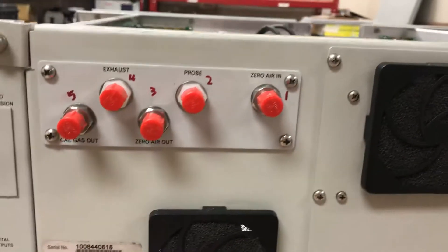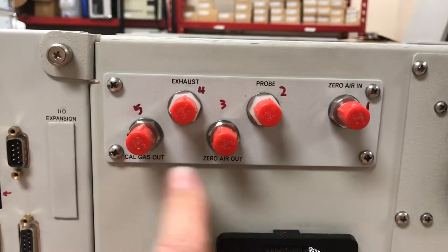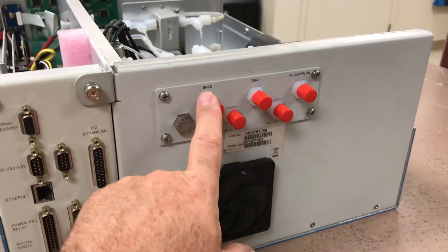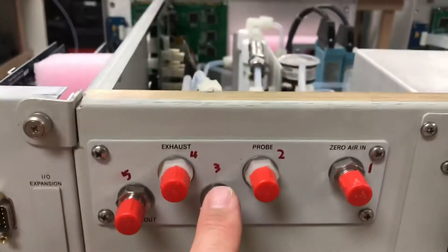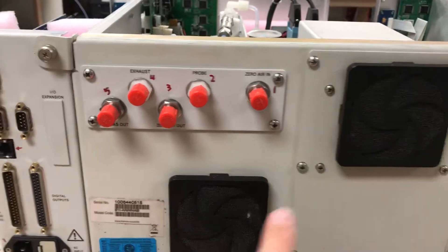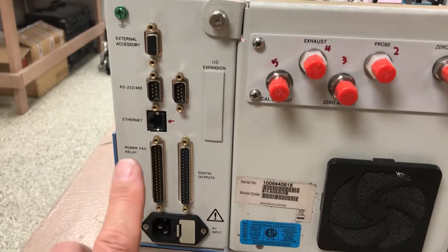Looking at the back of the 81i calibrator, it has cal gas out and zero air out connections. Cal gas out goes over to span, and zero air out goes to zero, allowing daily span and zero checks. There's also a probe connection and zero air in for the dilution air. A couple of cooling fans and the standard electronics: digital inputs, digital outputs, and RS-232/RS-485.